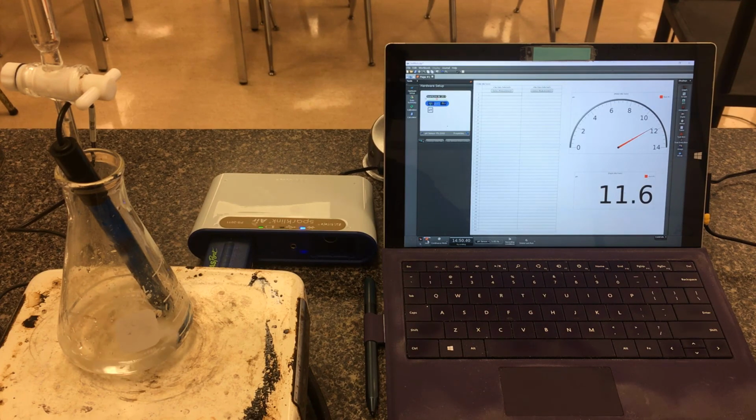Again, the difference between this trial and the one that we just did, we had diluted the base solution so that the concentrations here were a little bit more different, and that's why I took a little bit more volume of base before the equivalence point was reached. If I had phenolphthalein, this one here would be a deep pink. It would have turned pink way before, but again, we have a pH probe in there. We're going to be analyzing this graphically.